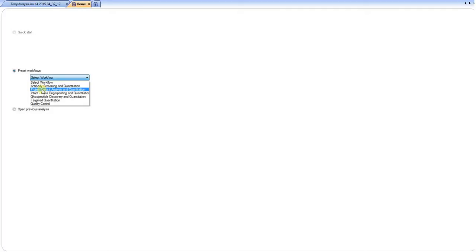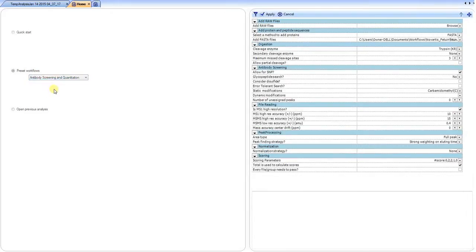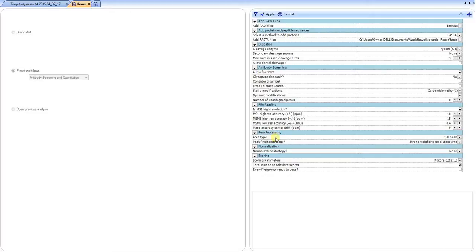The way that we would set this up is we would select either the antibody screening and quantitation or protein variant. In this case we select antibody screening. Once you select your preset workflow, all of the functions that need to be set by the user are opened here on the right-hand side, and we simply start at the top and work our way down.